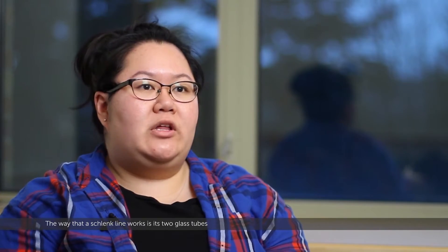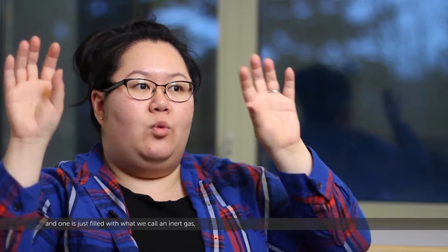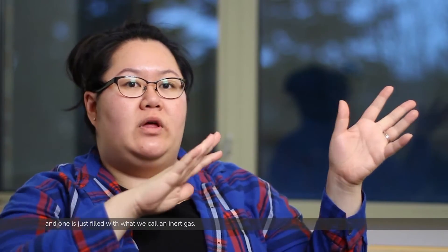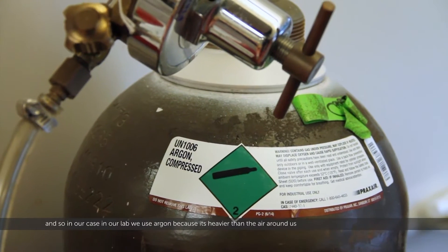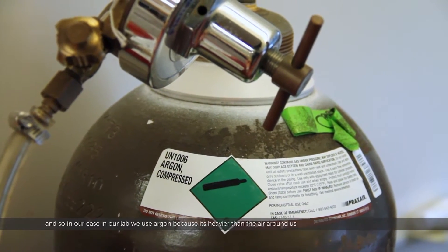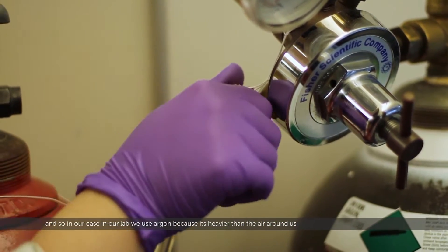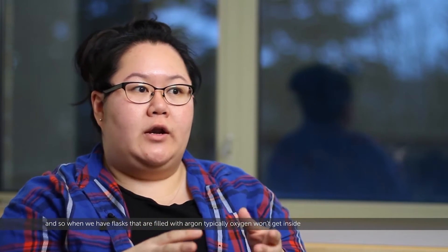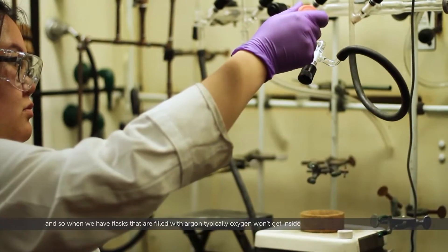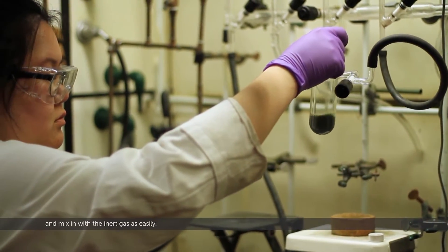The way a Schlenk line works is that it's two glass tubes, and one is filled with what we call an inert gas — a gas that doesn't react with the compounds we're using. In our lab, we use argon because it's heavier than the air around us, so when we have flasks filled with argon, oxygen won't get inside and mix in with the inert gas as easily.